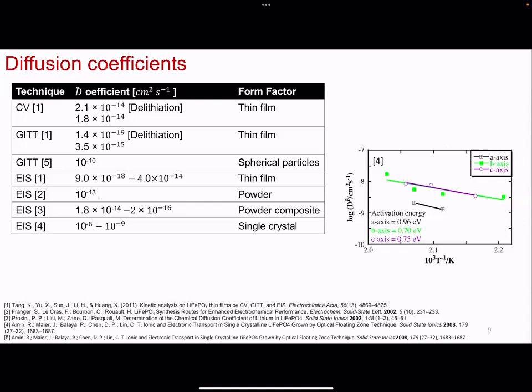Okay, so something to keep in mind when you're trying to design new materials and say, well, if a material has a tunnel structure, I would expect the diffusion coefficient to be like this along this direction, because there are a lot of caveats and asterisks that go into saying that. And in reality, all you can really say is the apparent diffusion is a certain value, and not necessarily always be able to say that it's solely because of a certain crystal structure. So it's all tied together.